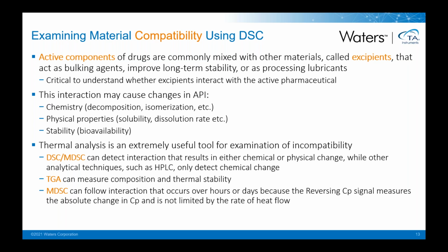In many cases, especially in pharmaceutical materials, active ingredients and excipients have to be compatible with one another in order for them to have some level of shelf life. If these components that are in an aspirin tablet or a Tylenol tablet or some other medication are not compatible with one another, as they sit on your shelf at home, in your cabinet at home, there's a potential that they're going to lose efficacy. It's potential that they're going to become toxic.